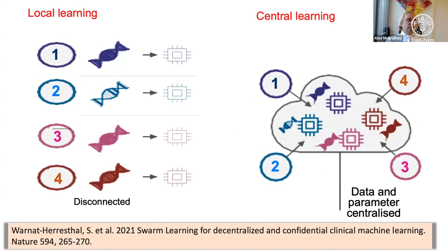I found this paper published recently in Nature, which talks about the same problem, but in the context of doing diagnosis using DNA sequencing. But the same thing applies. Here we could change the little DNA icons there for spectra, the little squares with spikes on them. You can think about that as the spectral models, which are the diagnosis. So you get spectral models and you got spectra.